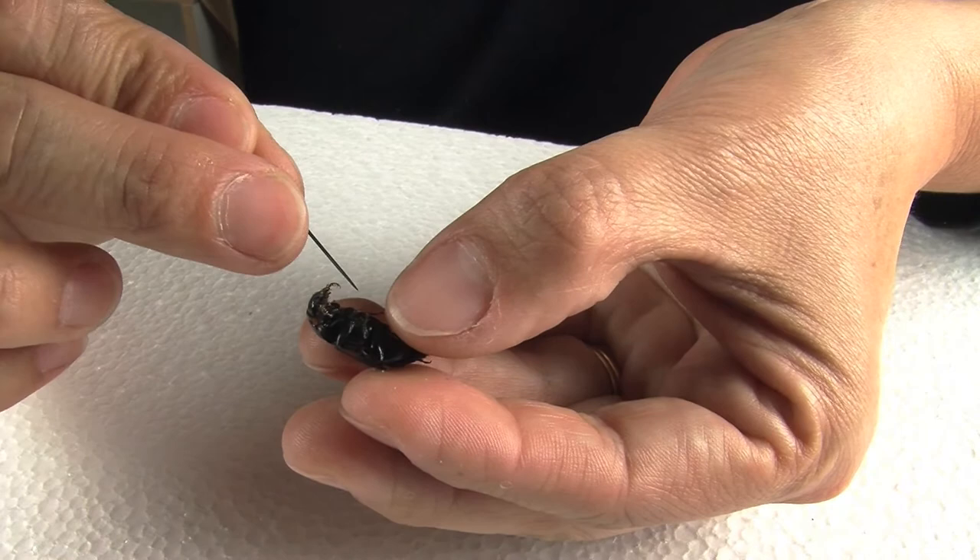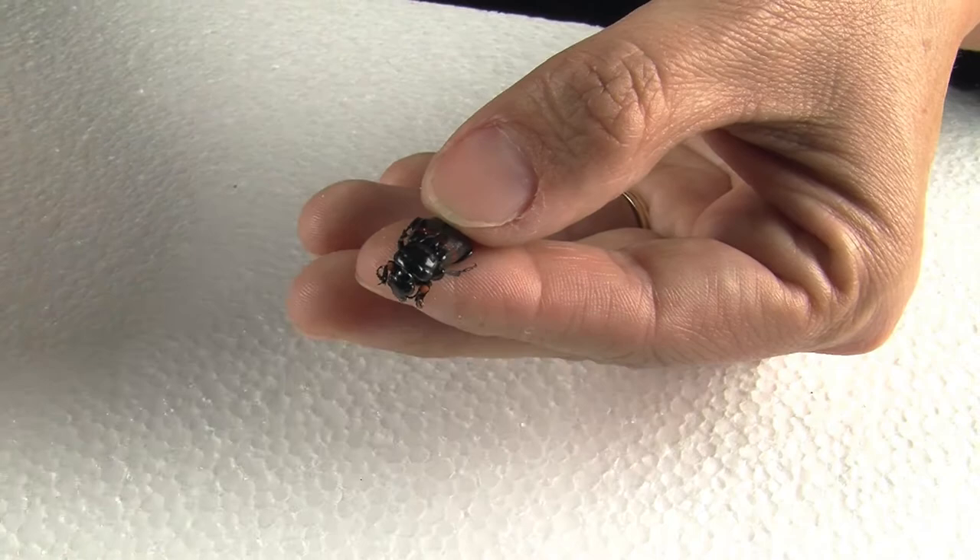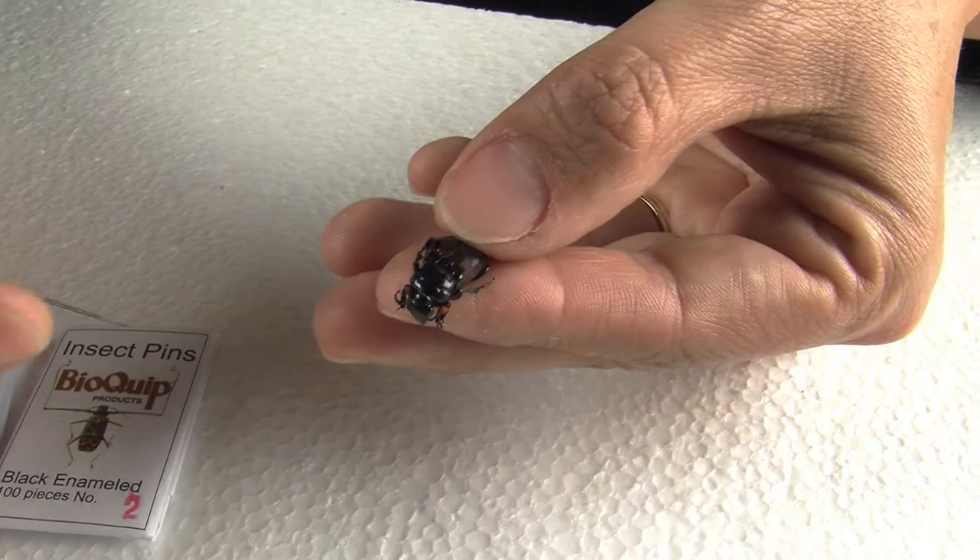The pin has to go on the second thoracic segment, which happens to be hidden underneath the first pair of wings in the case of this insect. For this size of insect, you can select either a number two or a number three pin. I'm using a number two.